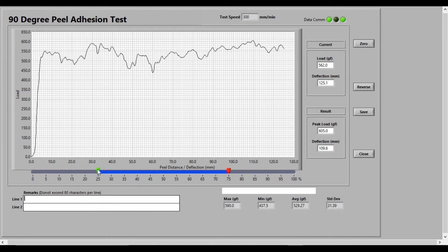You will see a slider under the graph. Try to select a flat portion from the middle of the graph. Neglect the starting of the graph and a little bit from the end as well. Your statistical calculations will be made from this portion of the graph.